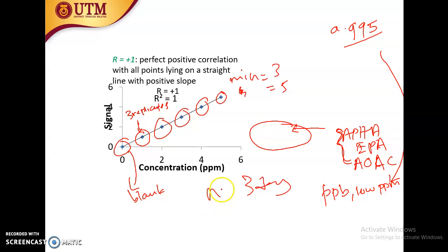Okay, this is all outlined in this standard. How many days you have to do? Sometimes 3 days. If in forensic, maybe 10 days. I don't know. If it's in EPA, it's usually 3 days. The more serious the data to be used, for example in court, the higher the accuracy and the higher the repeatability it wants to know.